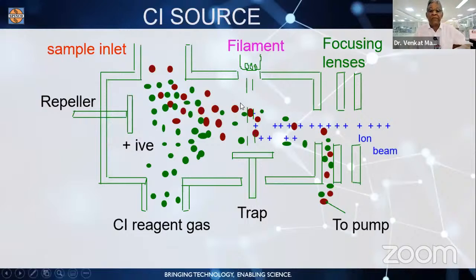The ionization becomes soft. When it becomes soft, this also produces the positive ion. Therefore, some proton may be left out, and your compound may be enriched. There can be an ion-ion interaction, because of which your compound will be enriched by 1 proton unit. If it is a 265, it will become 266. If it is a 312, it will become 313, M+1 ion. That's what you get out of this.